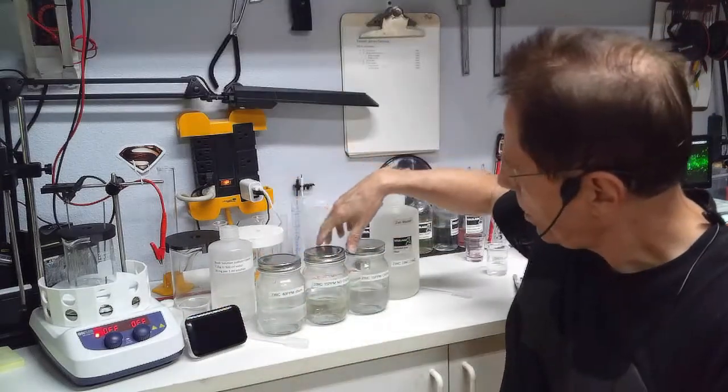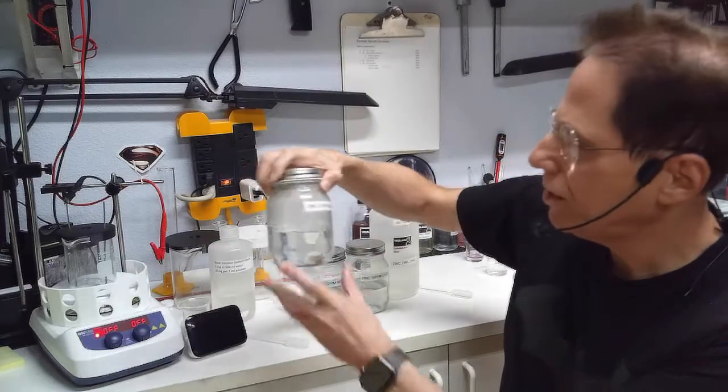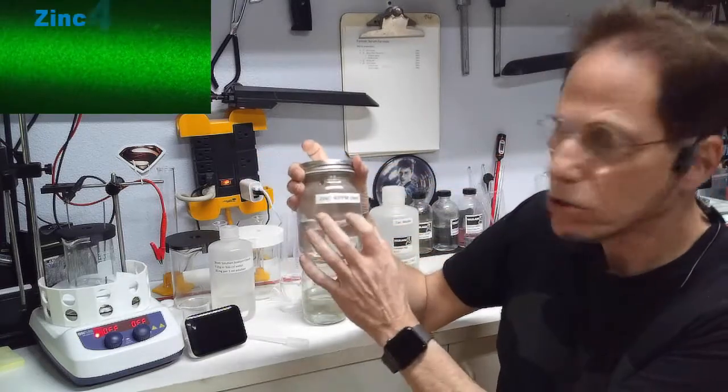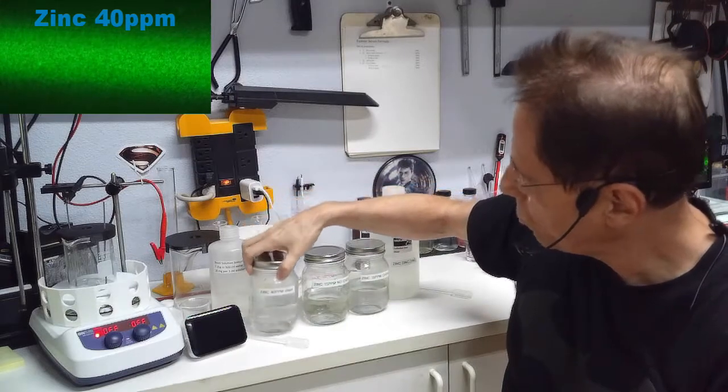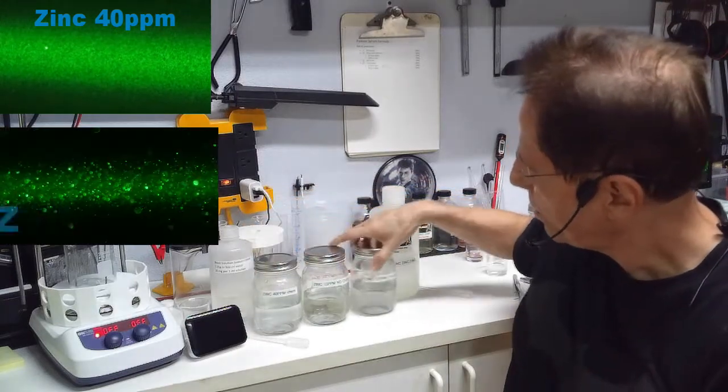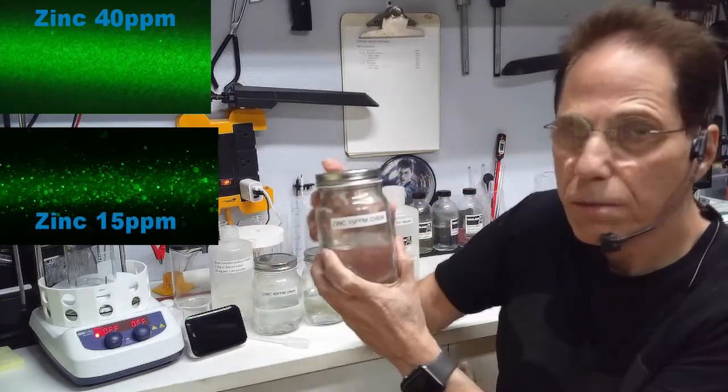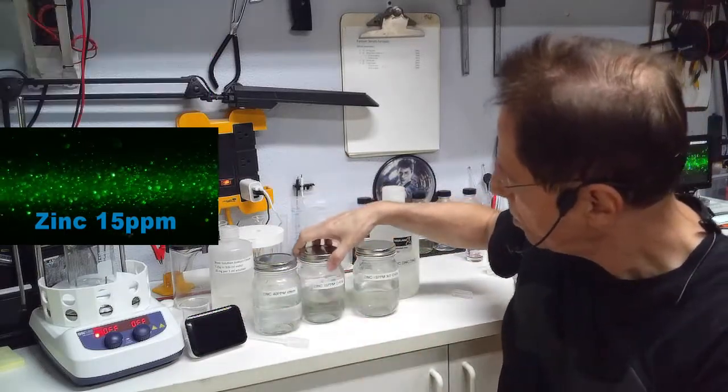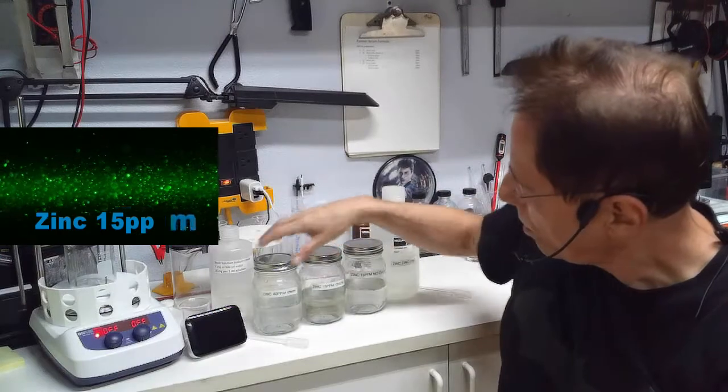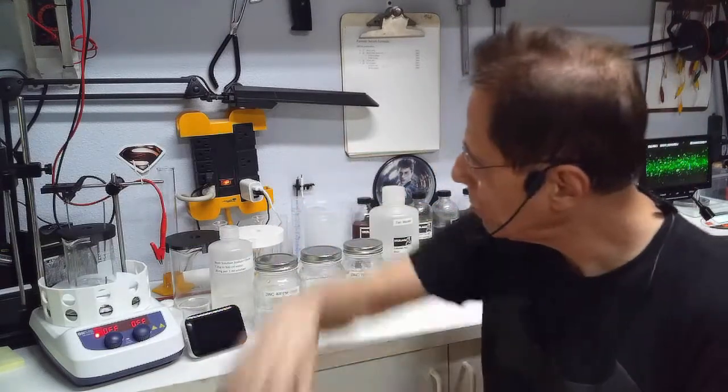If you follow the chart, you'll have a certain percentage of solution. This is a 40 parts per million zinc solution and this is a 15 parts per million zinc solution.